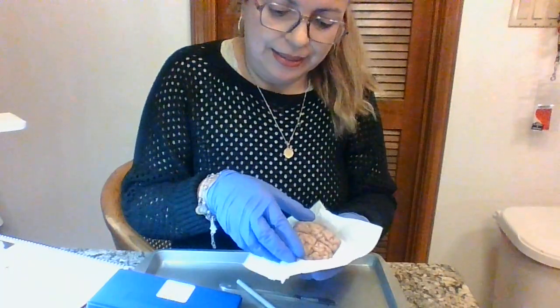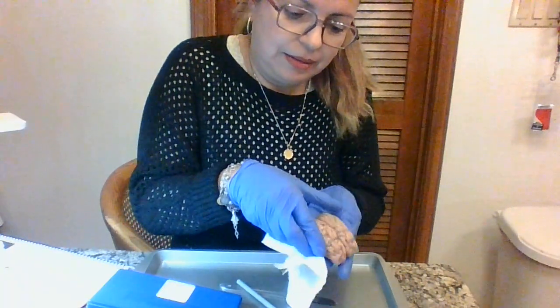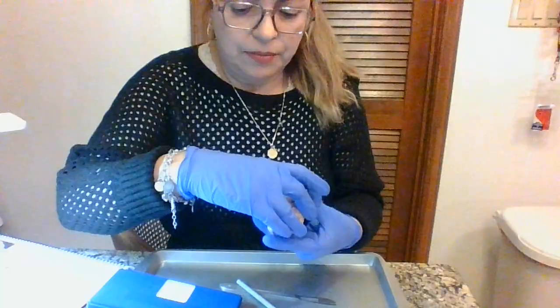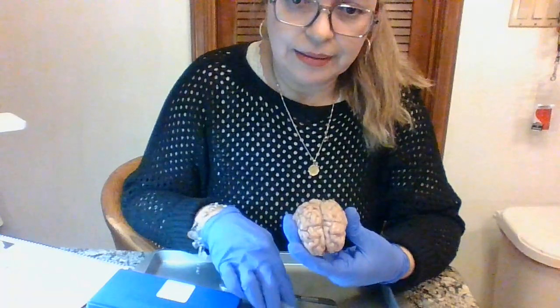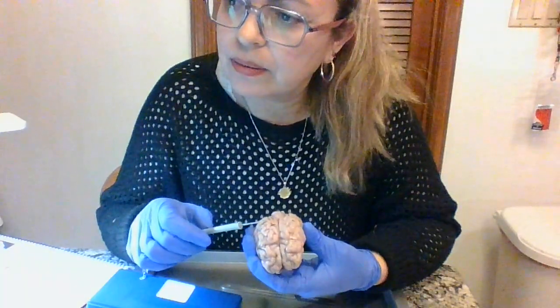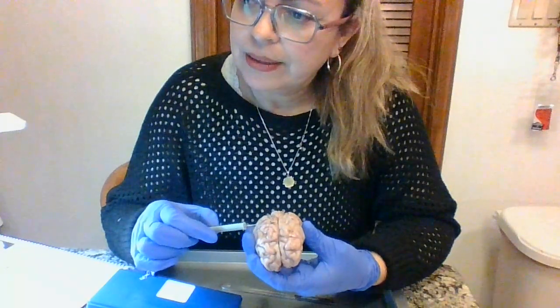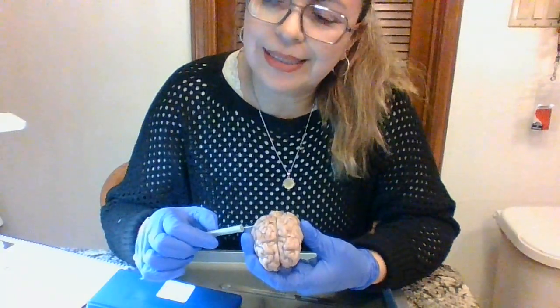Today we are going to dissect a sheep brain. It's kind of wet. Okay. Well, before we cut it, I would like to mention that the top layer is called the outermost, also known as the gray matter. The outer layer of the brain forming the cerebral cortex.